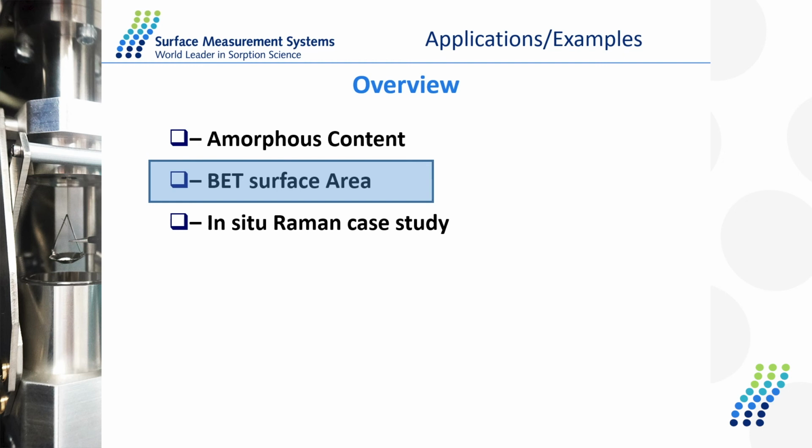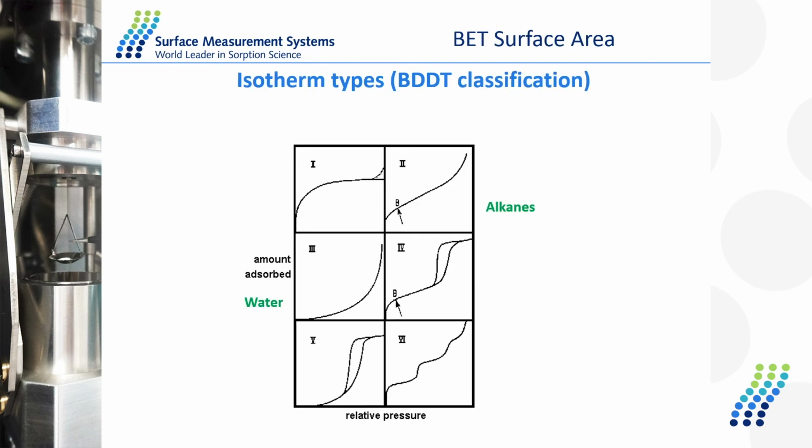How do we measure it? The measurement of BET surface area is a fitting applied to the isotherm plot. Independently of what type of material you are studying and what type of solvent you are using, the isotherm will have a shape that corresponds to one of the 6 plots reported over here. Now, to measure BET surface area, we have to generate a plot that is a type 2 right here, or a type 4 right here isotherm.